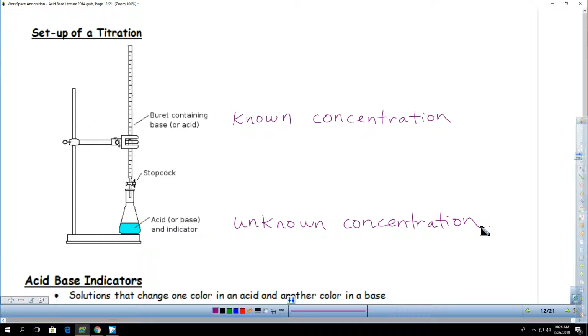And so we just said that one of the ways that we know when to stop is by looking at the pH range. If I have a strong acid and a strong base, I'm expecting that final solution to be neutral when I'm at the equivalence point. If the acid is strong and the base is weak, then I'm looking for the pH to be slightly acidic, even though I have the stoichiometric ratio from the balanced equation. But when you really start thinking about it, how do you know the pH of this final solution? I mean, do you just throw little pH strips in there? Or I guess you could.